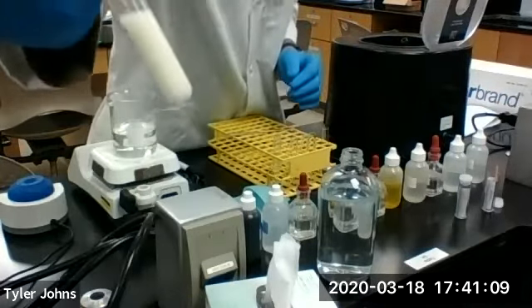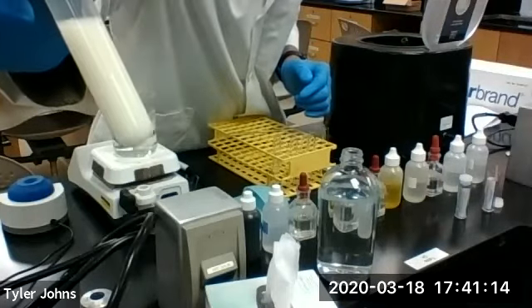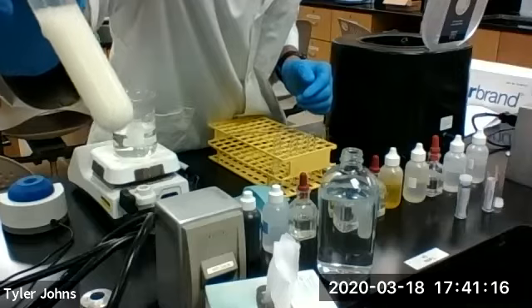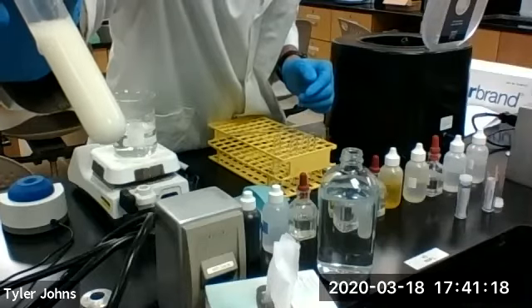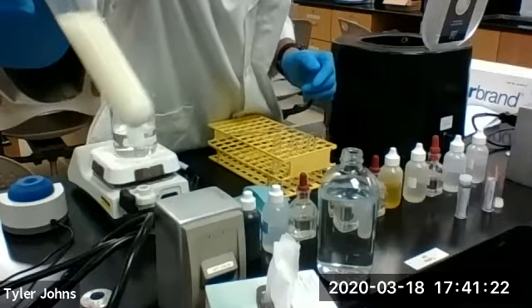And we can see that we're getting a white precipitate back into the solution, and that white precipitate is calcium oxalate. And this confirms the presence of calcium ion in our solution.